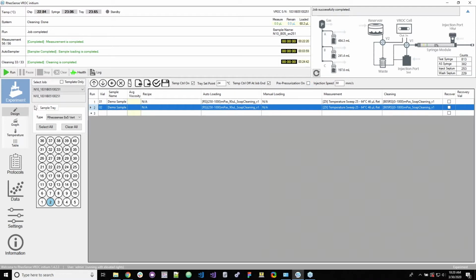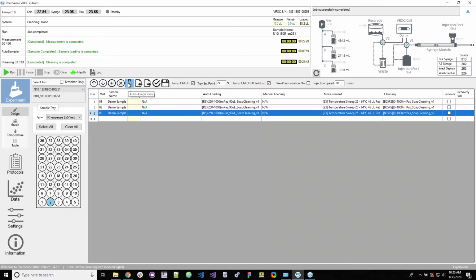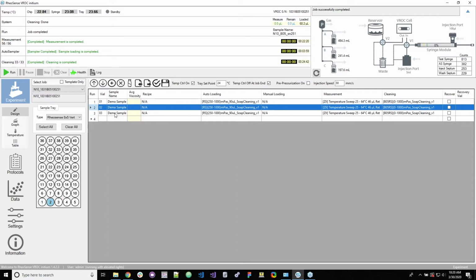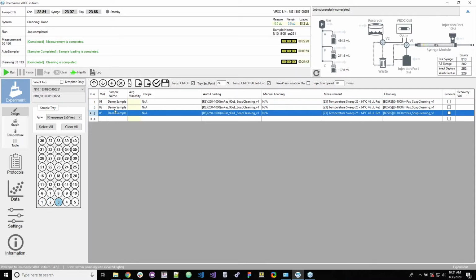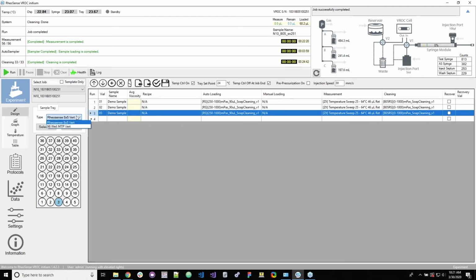So finally, we can start looking at these tabs down here. This is just showing you which file we're looking at. So if I click file 1, it'll switch over to file 1, file 2, then auto assign vials, and you can see the software is keeping track of which file you're looking at, which will help you when you're creating your measurement protocols for the first time or running a job for the first time. And then you can also select whether the 40 vial rack here or a 96 well plate. So that's all in the design tab of the software package.